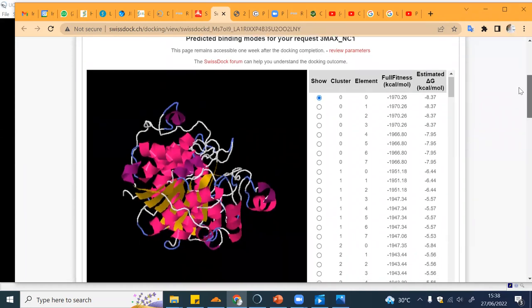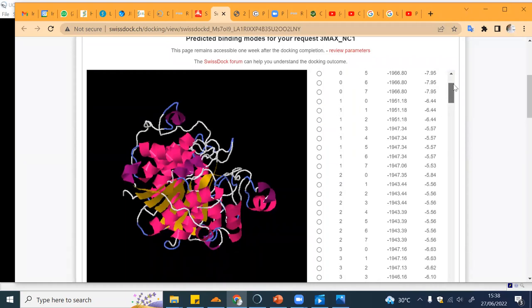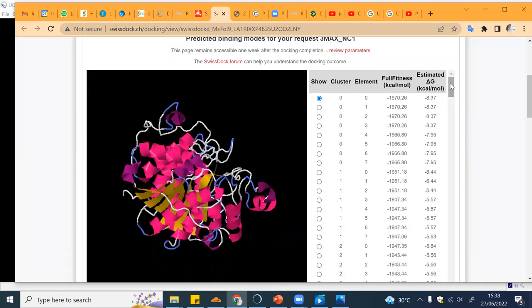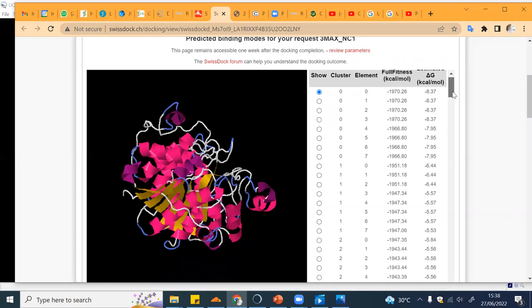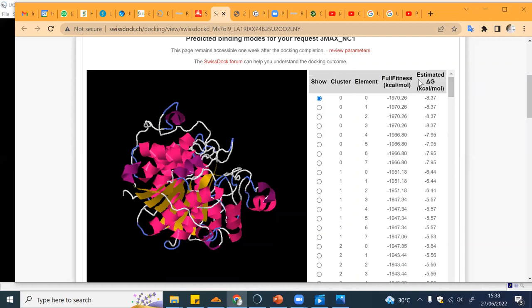This is the result. It already tried to dock your ligand to all possible binding sites with the receptor and you have different clusters. I will show you what it means later on. Basically in one cluster you can have different conformations of your ligand.